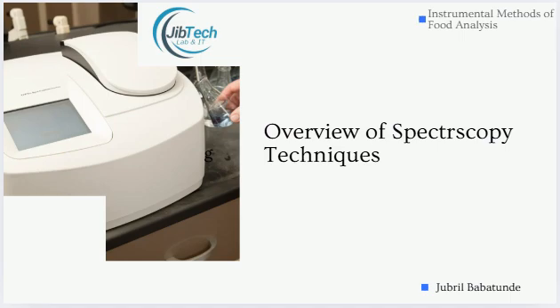And so today we're going to look at the principle of spectroscopy. In our last class, we started with an introduction into instrumental methods of food analysis. And if you recall, among the principles that were mentioned that we use in instrumental methods of food analysis, spectroscopic techniques is one of those principles. And so today we're going to start with spectroscopy.